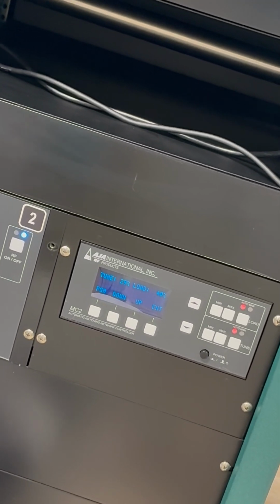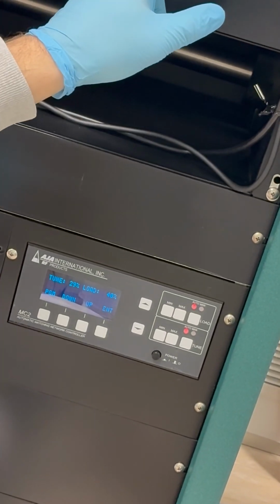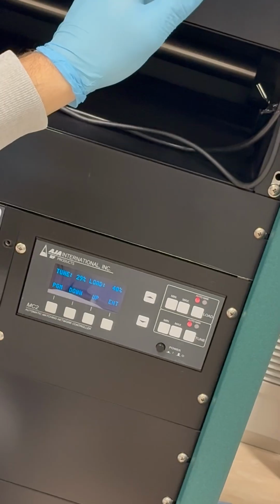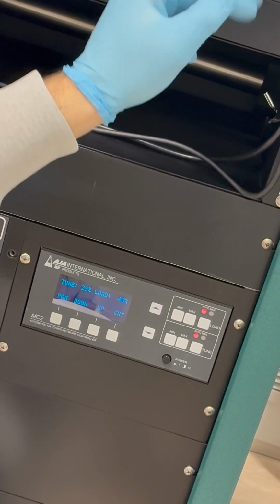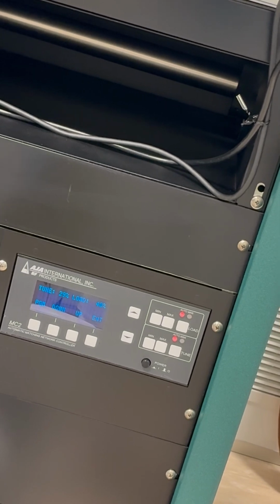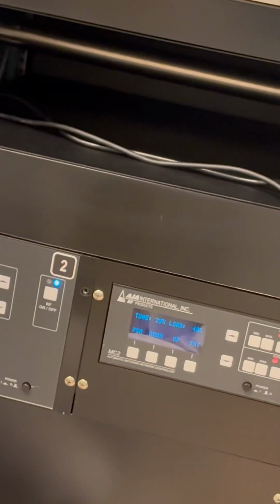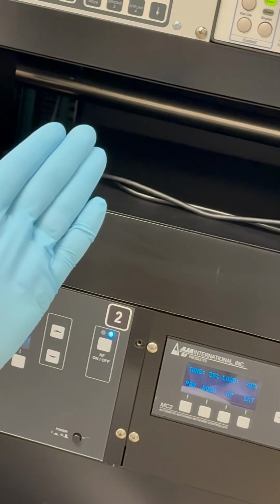And it's going to say that all the way up until 243.4. It's going to say 244 all the way up until it gets to 244.5, and then it's going to tick up to 245, right? And so this is the problem.